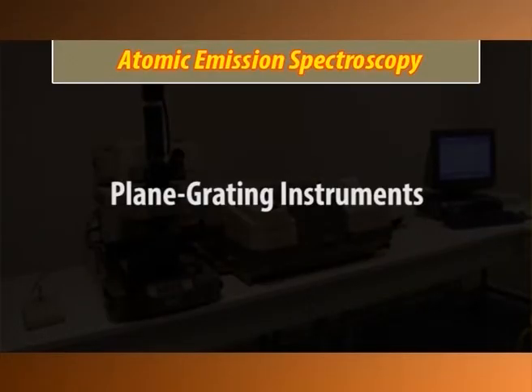Plane grating instruments. Plane gratings serve only as the dispersing element, and therefore, a pair of concave mirrors is usually required to image the entrance slit onto the focal plane. Different spectral regions are focused on the camera detector's film, or different wavelengths on the exit slit, by rotating the grating.